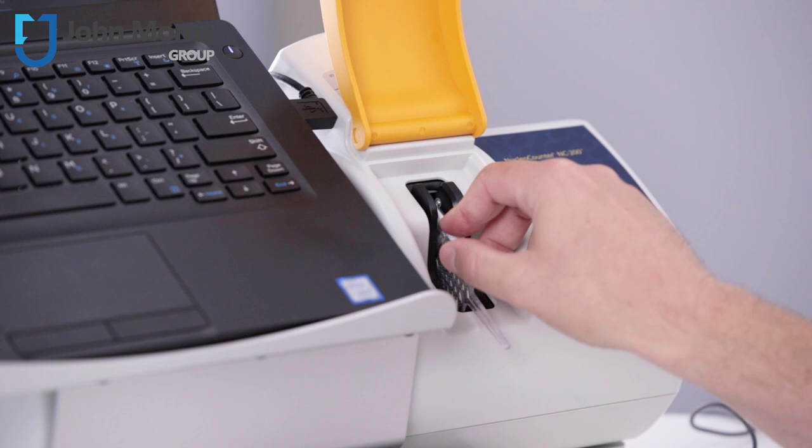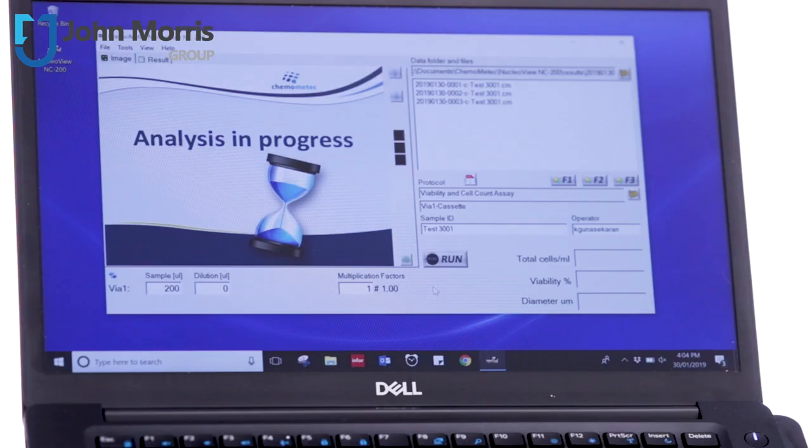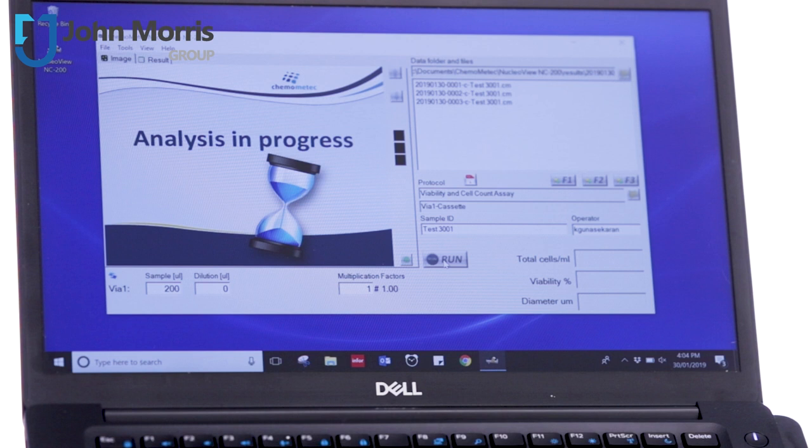So the instrument has a 465 and a 375 nanometer wavelength LED and either push the run button here or the run button on the screen. And away it goes.